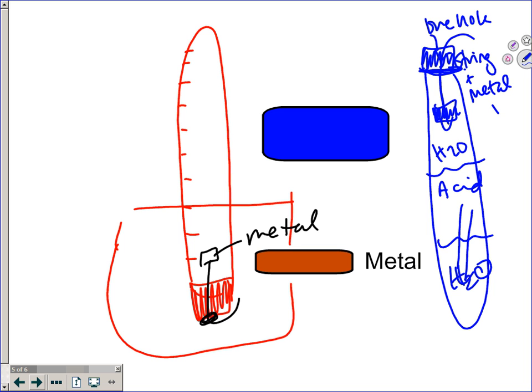Your beaker will be halfway filled with water already, and so as soon as you take your thumb out, the reaction will begin. So your acid, which was on the bottom, right, because it was dense, it was up here for a moment, it starts to sink down, so HCl. And as soon as the HCl hits this unknown metal, what are we going to start to observe?